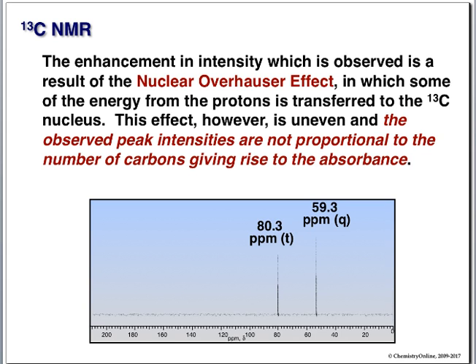So this is actually our quartet. So this is our CH3, and that's our CH2. They're about the same size, but what you typically see in a spectrum is you will run an uncoupled, determine your splitting, then you will run it proton decoupled, and you will simply identify the chemical shift of the carbons involved.